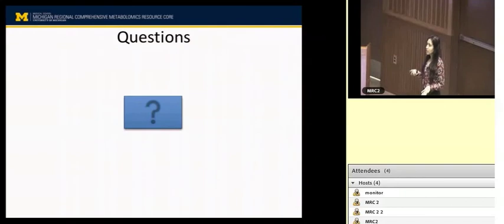Like I said, there are a lot of things to keep in mind, like how big is your study and what conditions are there, like is there a time course. Then you need to take into account that you don't run one time point at once and other time points at another time. So you don't want to create any variation by yourself. When you're randomizing, you need to keep in mind that you don't put any sort of bias by just putting them in a certain format. That's why you need to randomize them.